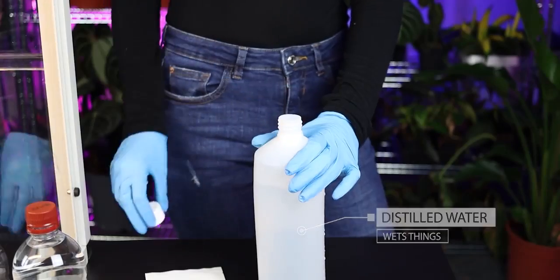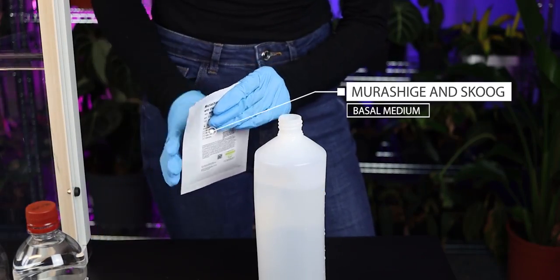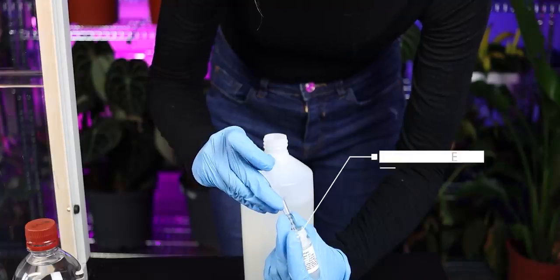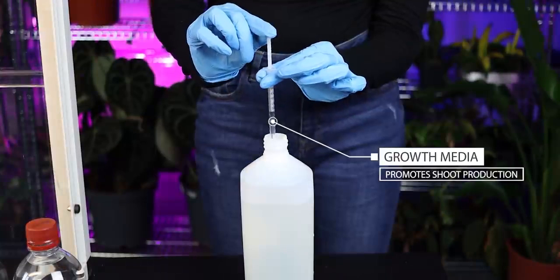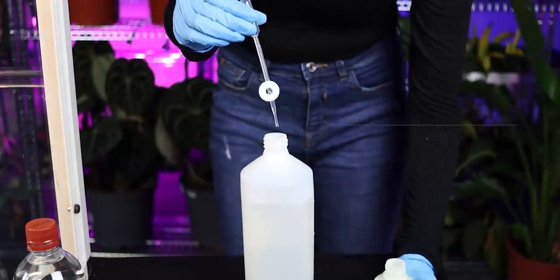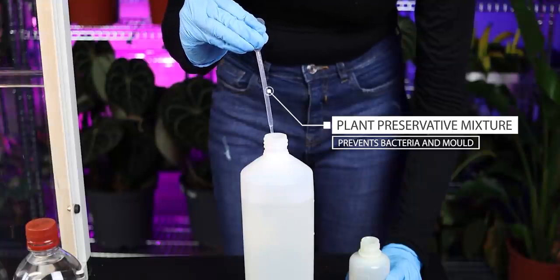For this, I'm using MS, which is essentially a mixture containing all of the essential growing chemicals for these plants. To this, we add a little carbohydrate in the form of everyday sugar, growth hormones, and plant preservative mixture. Plant preservative mixture, also known as PPM, is antimicrobial, which means it helps prevent any potential fungus and bacteria growth inside our tissue culture containers.